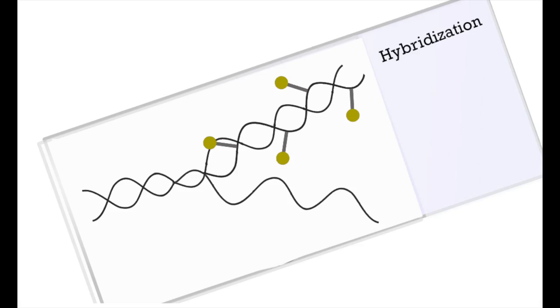The goals of this video are to illustrate our basic procedures and provide helpful hints. Although the procedures and images shown are for maize, the techniques have been used successfully in a number of plant species. Today's emphasis will be on using probes made from high copy number repetitive sequence clusters, or ribosomal RNA genes.